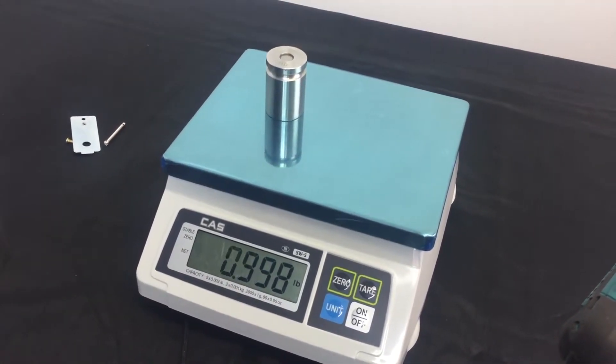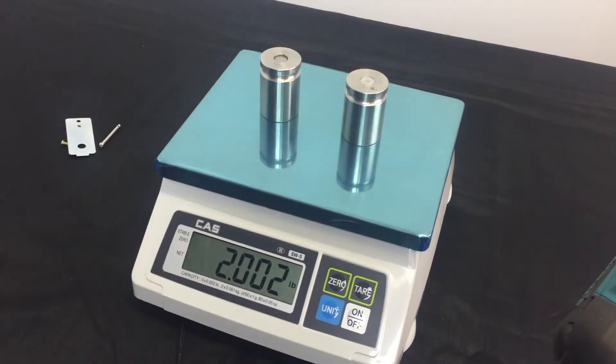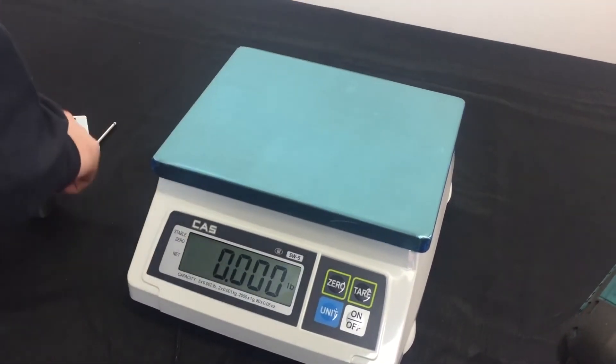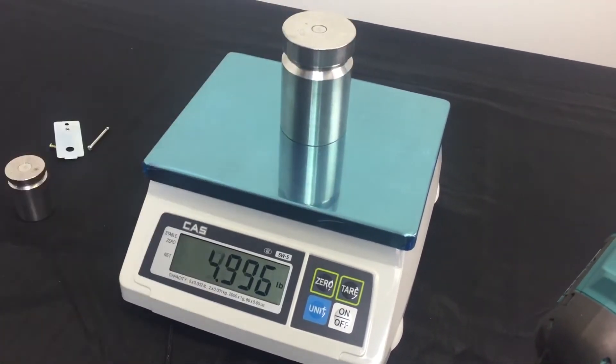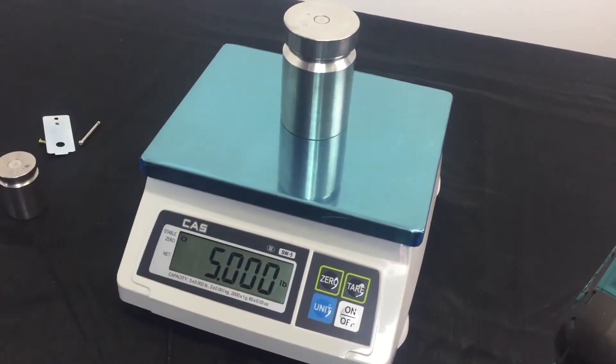Place one pound on. One pound steady. Two pounds. Two pounds is good. And now, let's check five pounds for full capacity. Five pounds on the money. We're fully calibrated.